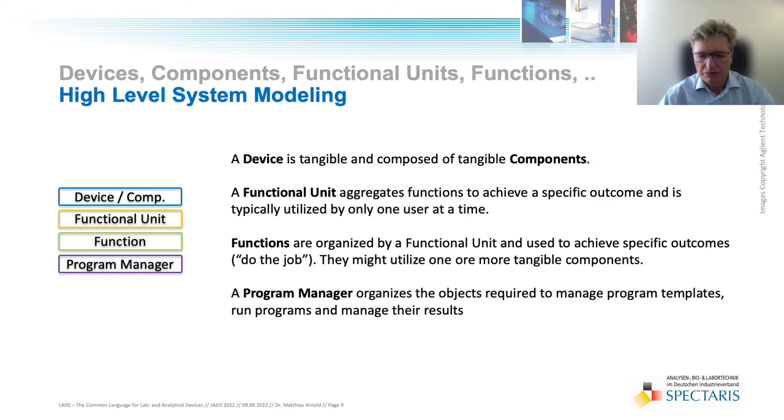Second, the functional view, which deals with data relevant for the operation, automation, and orchestration of an instrument. A functional unit aggregates functions to achieve a specific outcome and is typically utilized by only one user at a time. Within the functional units, you can find smaller functions which actually do the job, like sensor measurements, closed-loop controllers, and so on. Many laboratory and analytical devices allow the user to define and run programs, also called methods. The program manager organizes such program templates, runs programs, and finally manages the result data generated during the run. In other words, the program manager provides device-level orchestration.